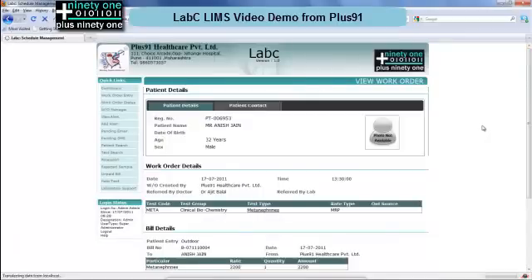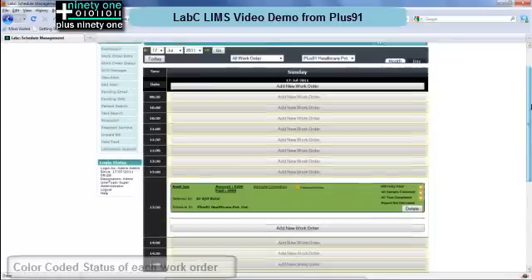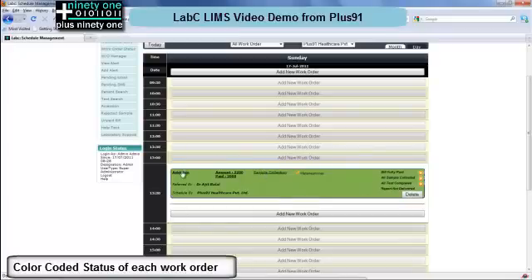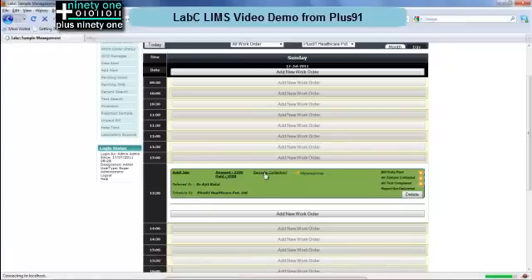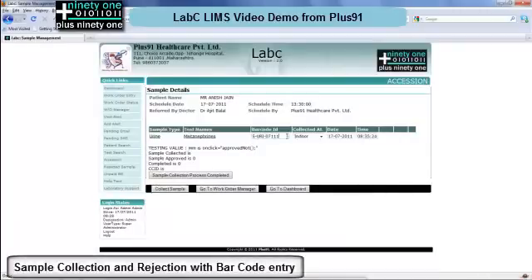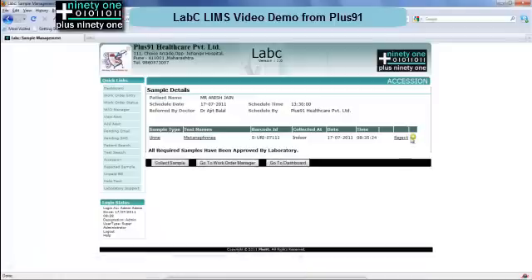Now you can see these entries in the work order status manager. Right now it is in green because it is incomplete. You can click on the name to update the schedule, the billing details to update the bill, sample collection to collect the sample, or the test entry to actually enter the test. Here you can see the barcode ID. You can update it, collect the sample and click on sample collection. Also rejection of samples is possible or addition of new samples.